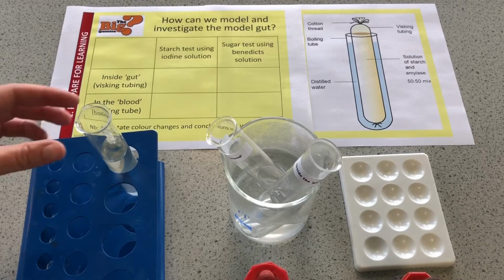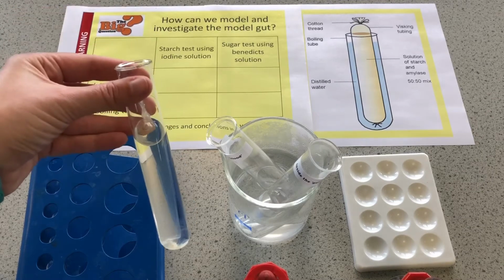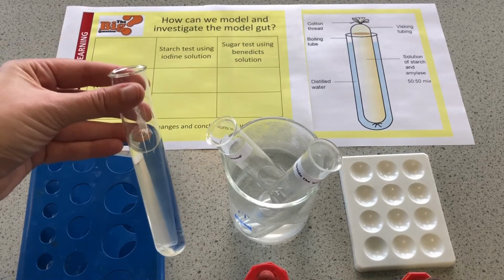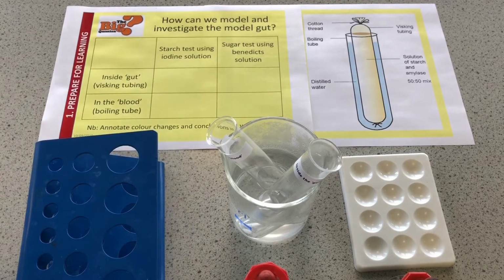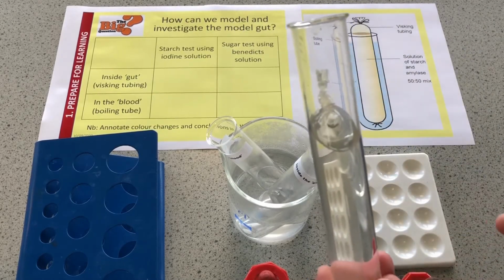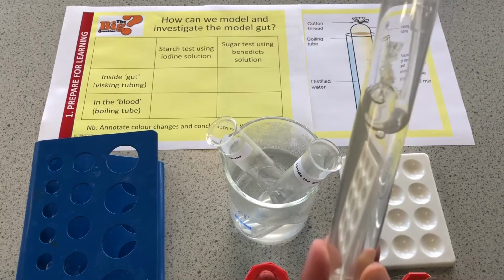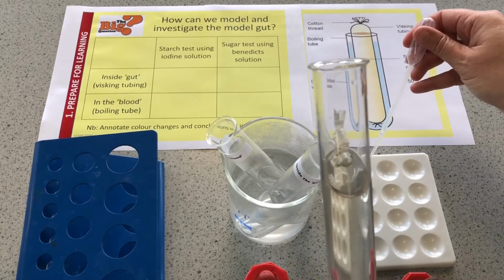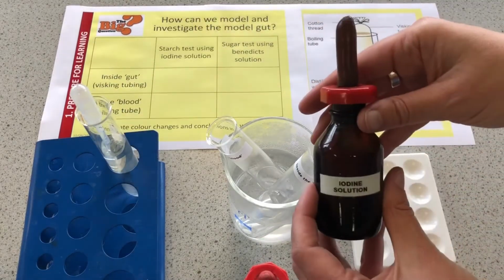So my model gut has been sitting there with the starch being broken down by the amylase, surrounded by the blood. The water is representing the blood. Now I'm going to do two things. I'm going to first of all check for starch. I want to see, is there any starch in the blood? So I'm going to extract some of the blood and put it into this tray. And I'm going to test using iodine solution.